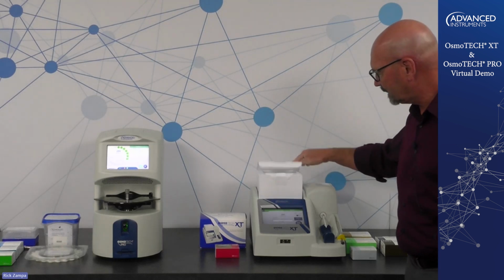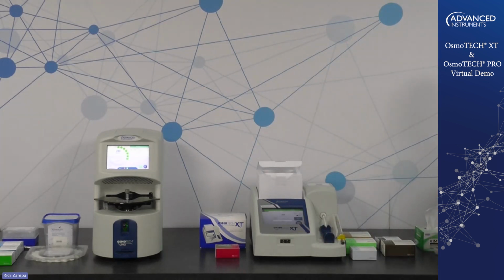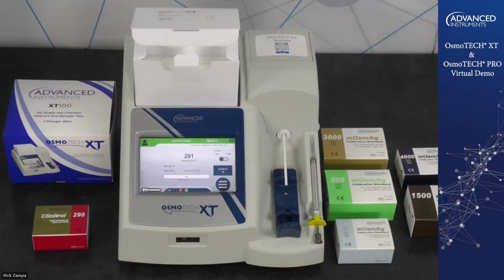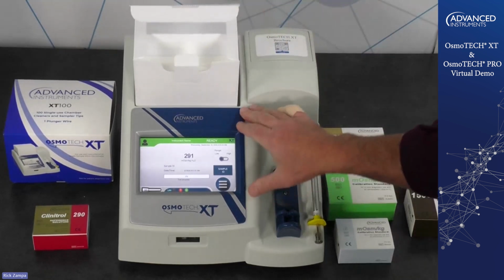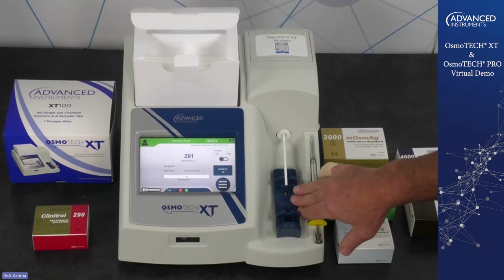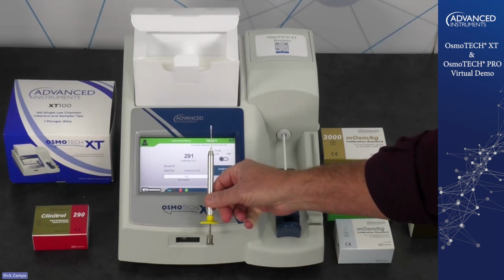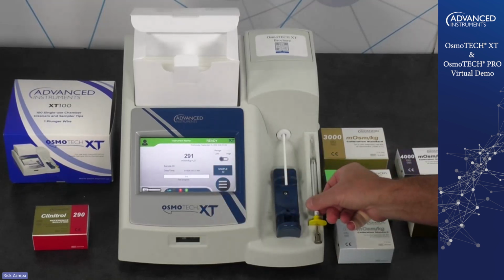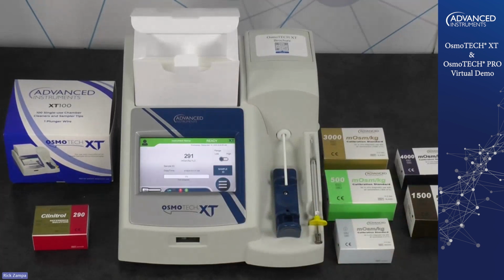I'll go into that when I run a sample for you. Have a built-in barcode scanner. There we go. That's better. So again, you have your sample tips and cleaners here in the box on the top. Touchscreen display, built-in barcode scanner. Here's your chamber, your cooling chamber, and your slide to introduce your sample. You have your sample handler here, which is used to introduce the sample into the instrument. And that pretty much covers the overall look of the instrument for right now.